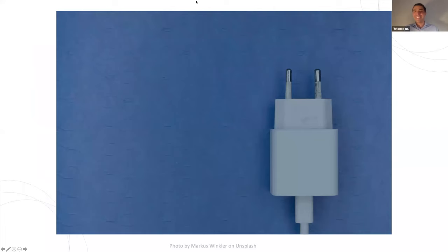Thanks, Seth. Great. So a bit of a different take today, and we'll weave that throughout. And as you saw from the title, about plugging and playing. We're going to step along that in the process today across a number of different flow cytometers and share some data about what that can mean across a number of different instruments.